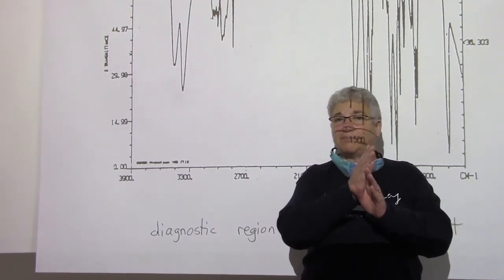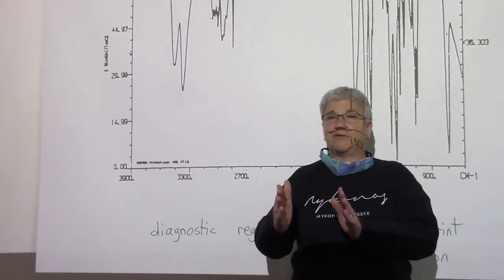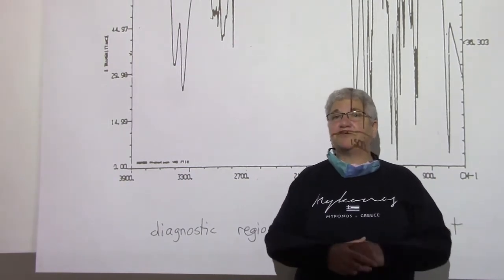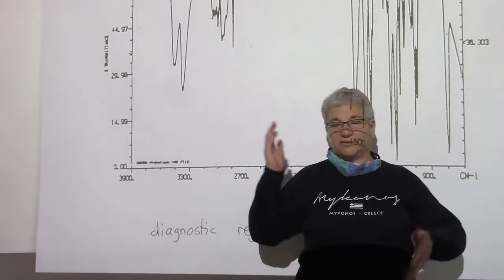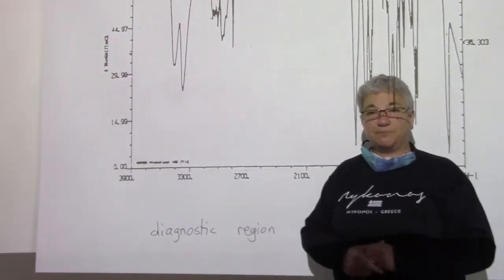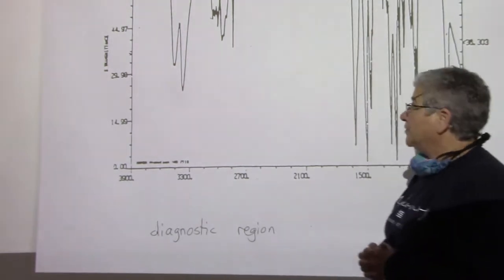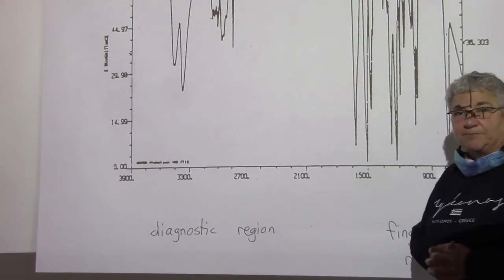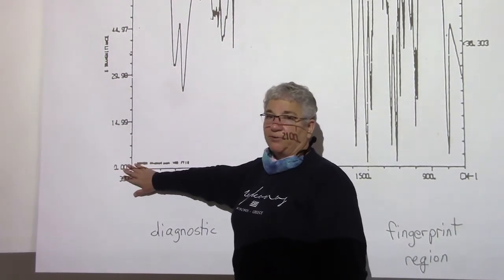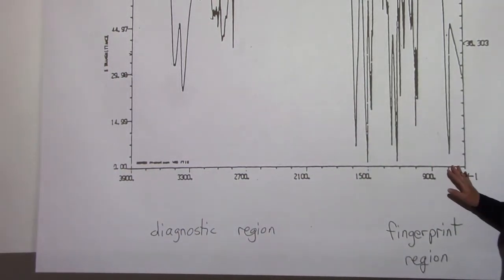And if you want that bond to bend, well, that's a different frequency. So molecules will actually absorb a fair amount of infrared light because they're all bending and stretching, and you have the pleasure of interpreting the spectrum that comes out of that absorption. When you look at an IR spectrum, for organic, we tend to start at about 4,000 over here, and we usually go to about 800 on this side.